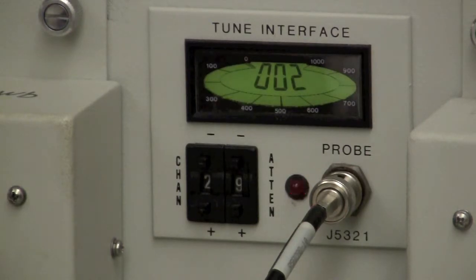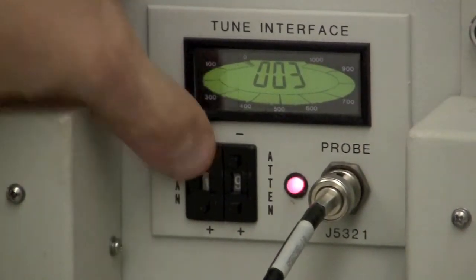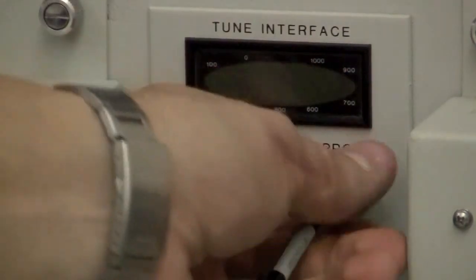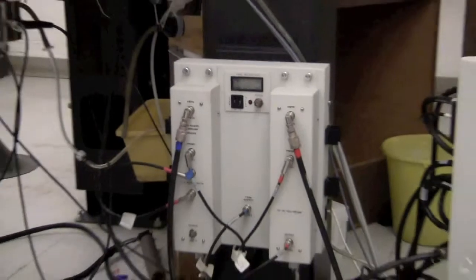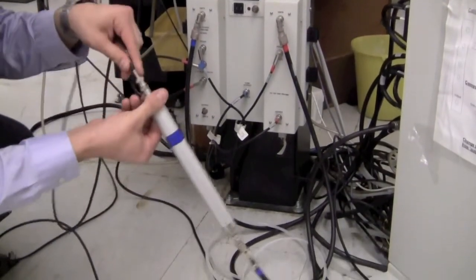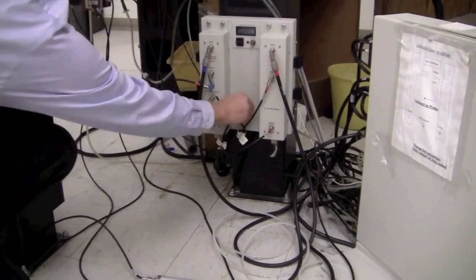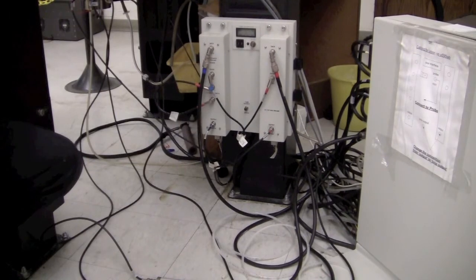A value of two to three is pretty good for the carbon channel, so that's good enough. Switch the channel back to zero, which turns the tune interface off. Then put the cables back in their appropriate places: the probe goes back on the carbon channel of the probe and the tune output goes back on the carbon output. Now we're done tuning.